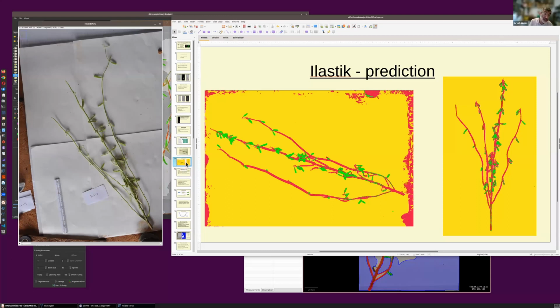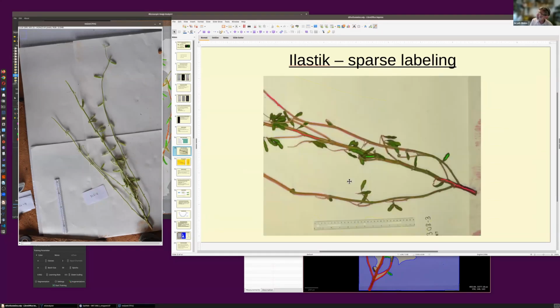When I do more annotation, it takes a lot longer to train, and it tends to be a very good thing for use within one class of plant. Like if I annotate this plant, it'll do this plant pretty well. And that's also not bad. Very often that's exactly what you want. You take a microscope image and you mark a few cells and then it finds all the cells for you. So it can be very good.